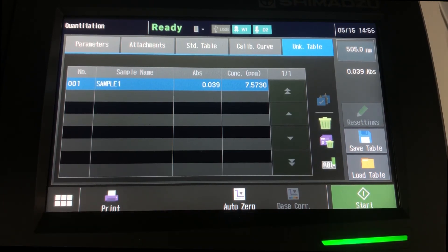That is how Quantitation measurement can be done on the UV-1900i Standalone operation.